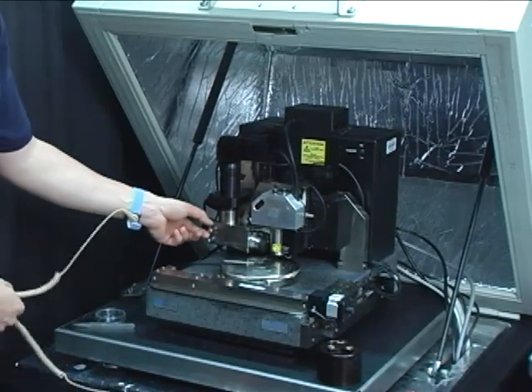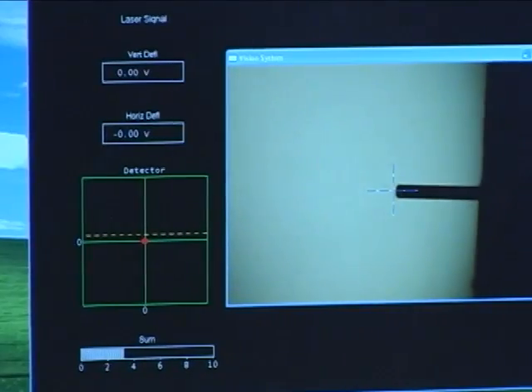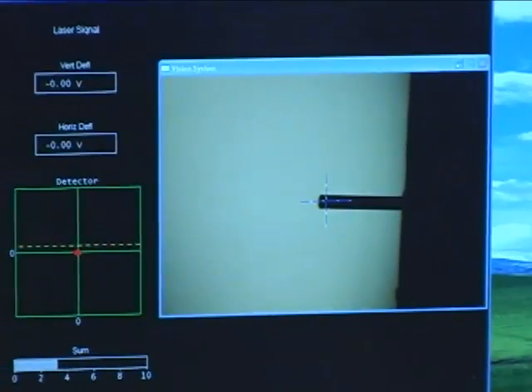And next, we will physically move the optical microscope until the crosshairs on our screen are centered on the backside of the tip.